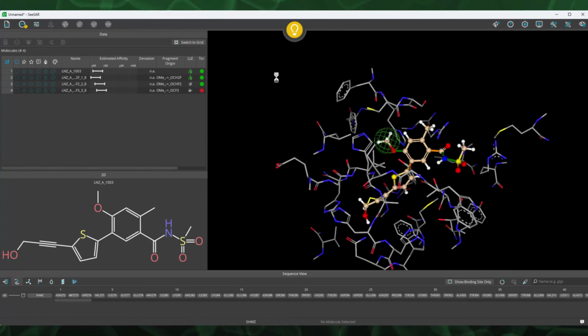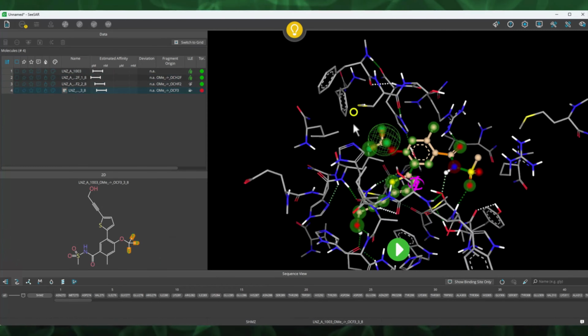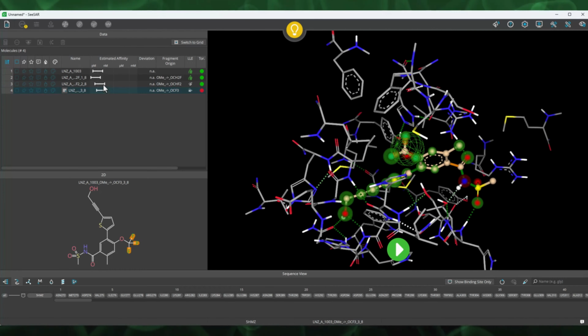We notice that there are not as many results generated as before, but importantly, all generated results contain a halogen at the requested position.